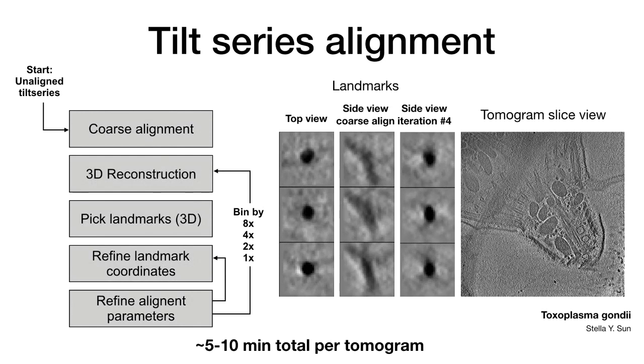When I say usually, I have not yet found a case where it doesn't work, other than really bad tomograms where the tilt series was just collected terribly, where it had like a half frame shift in the middle of the tilt series or something. Basically works everywhere.